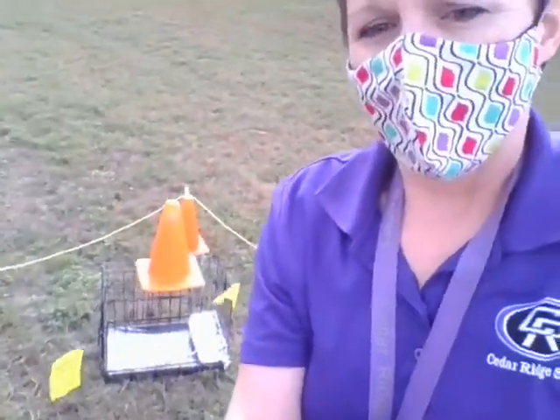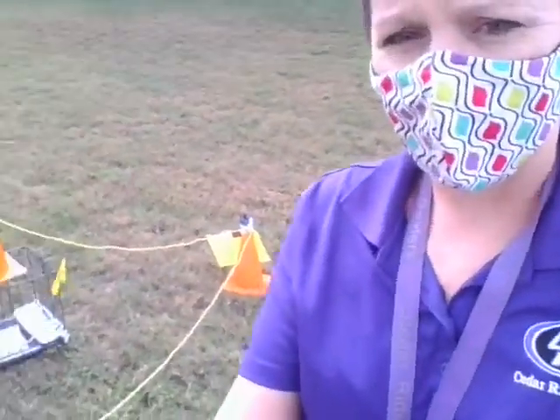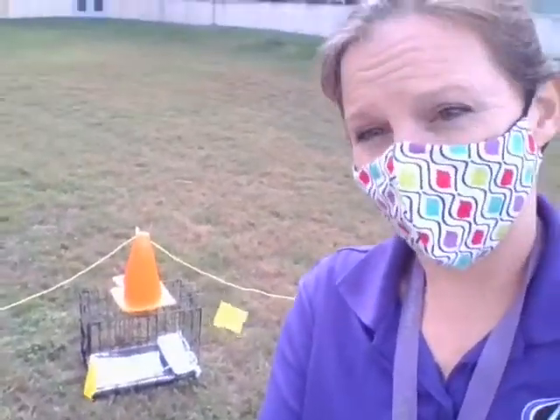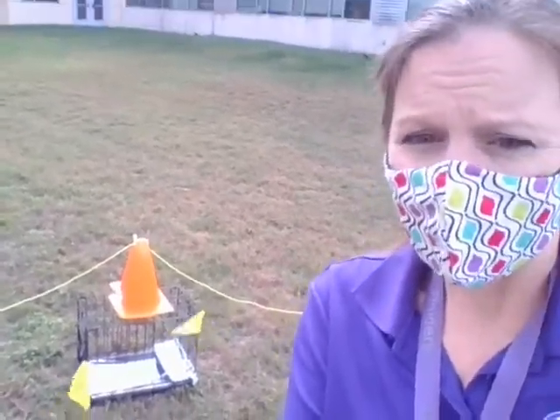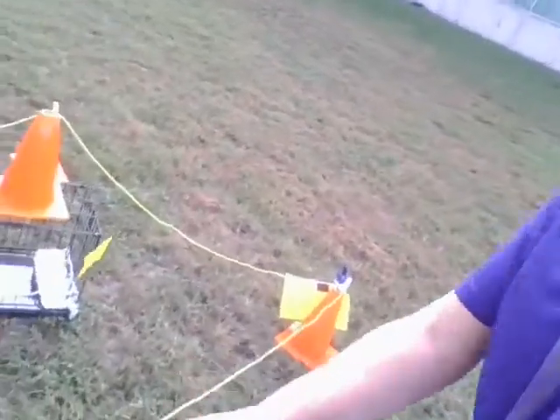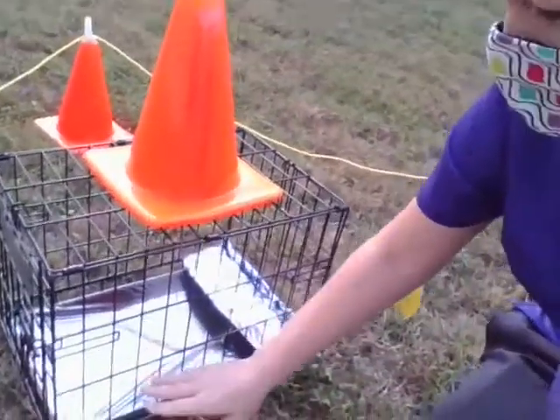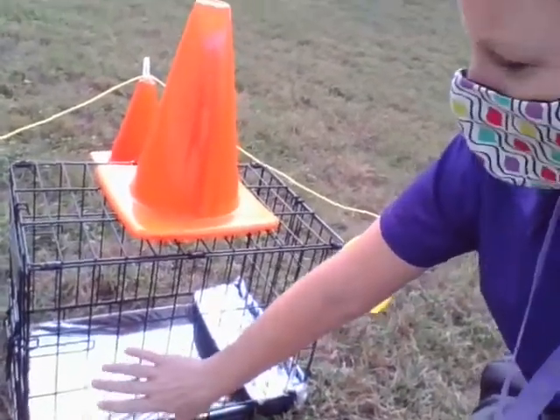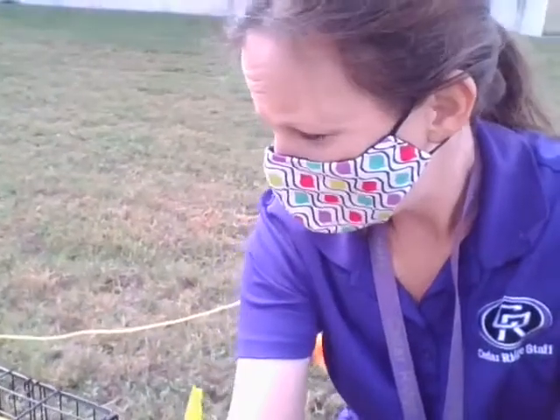All right, so we're going outside. Thanks for going on this little mini tour with me. What we have is sort of set up back here — it's really pretty basic. If you're in school or in the area, you can come check this out. Don't mess with our conditions once they get out here, but feel free to come by and just see what's going on. See if you can identify — without really touching anything — if there's insects around it and what kind they might be. We will essentially be dissecting them or at least trying to identify the species. Our conditions are going to be in here. We've got some areas that are just shaded — that's where our shaded condition goes. This holds everything down so it doesn't fly away, and then we're just going to put all of our chicken hearts on this tray.